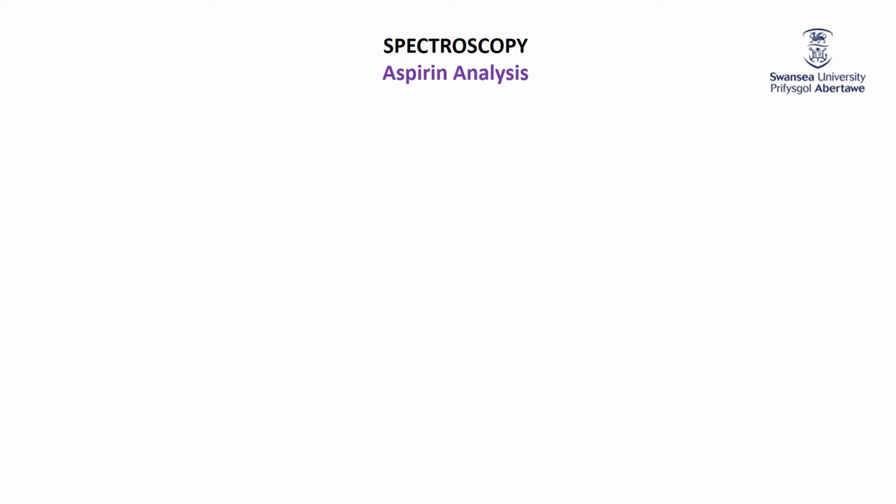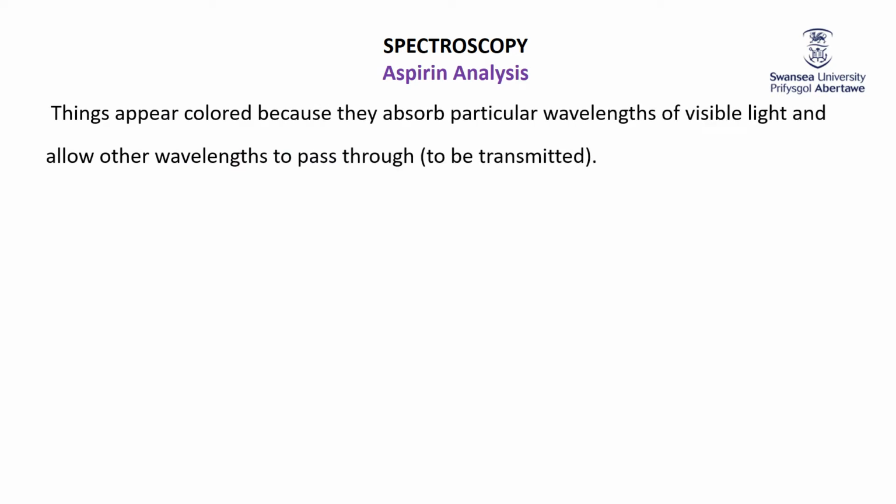So the second experiment in our Swansea Analyst contest for this year is all about aspirin analysis by spectroscopy. The actual experimental part of this is dead easy. It's the calculation part that can take some time, and also it's worth spending a little bit of time introducing the background for it.